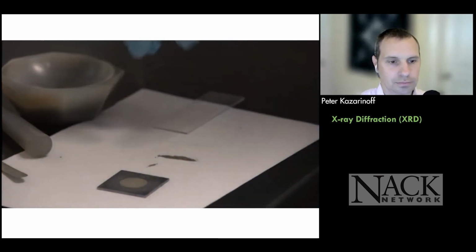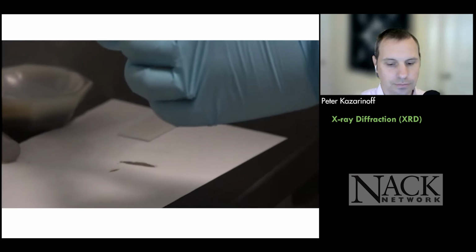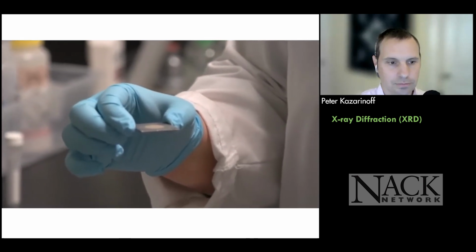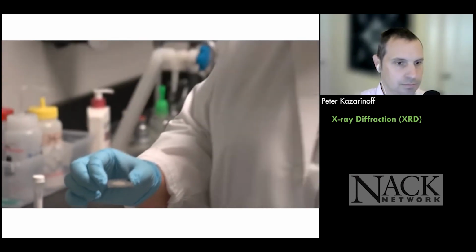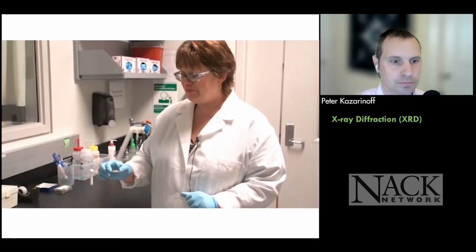This is actually a fairly important requirement when we're prepping any sample for powder X-ray diffraction. The height of the sample is very critical to the quality of the data that you collect. And so we try to do a very nice job of making sure that that is the case. So in that video, what you saw was Nicole preparing a sample for the X-ray diffractometer.